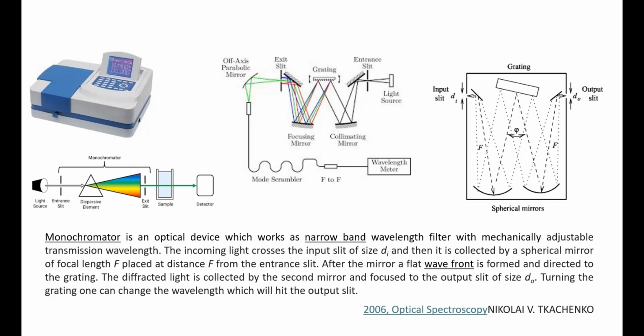Here it is carved, or marked, with fine lines which are 1 micron in diameter or even less. There is a distance between the two, so whatever light falls onto it, these gratings are going to work like a prism and split the light into component wavelengths, right? That is what you are seeing.